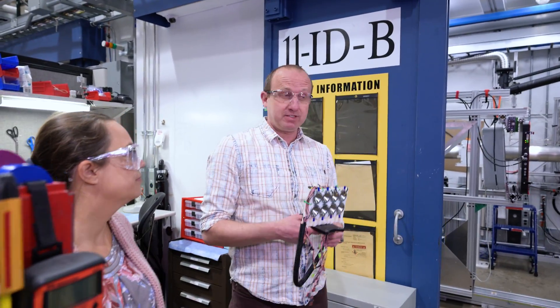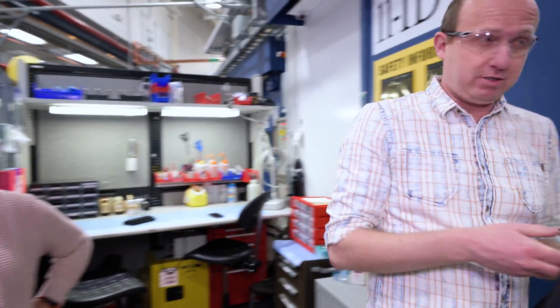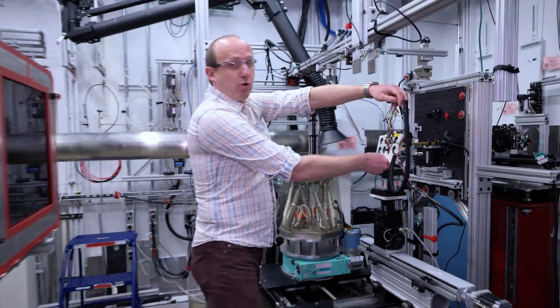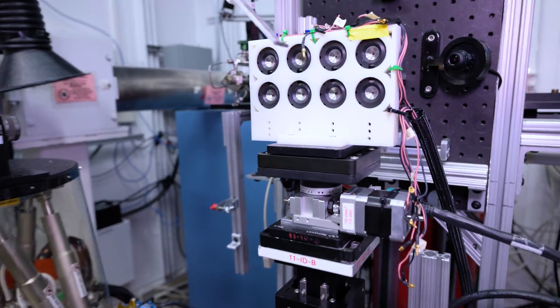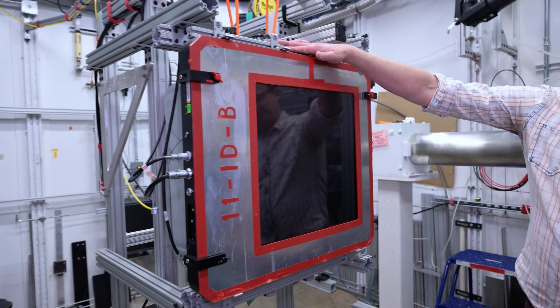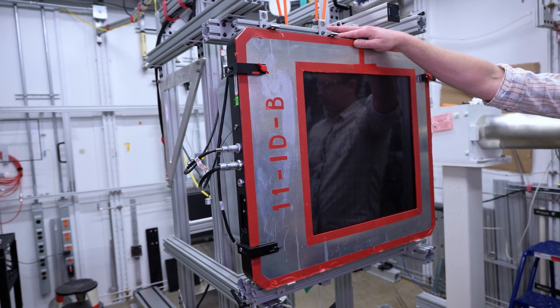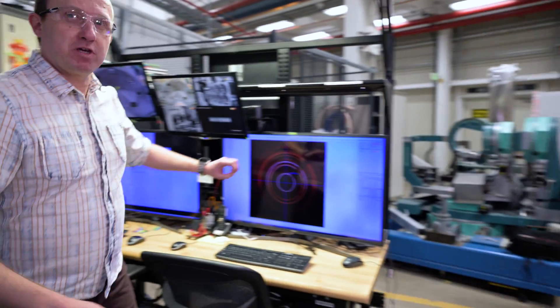In this station we study materials, and to do so we use X-rays and detectors that you often see in doctor's offices when we take chest X-rays. In this case however, we X-ray materials and we take images that look more or less like the one over here.